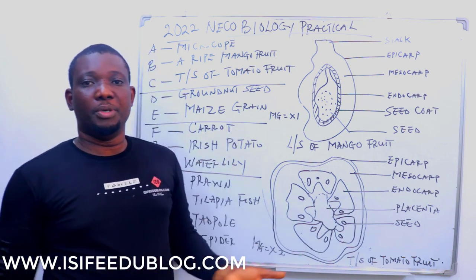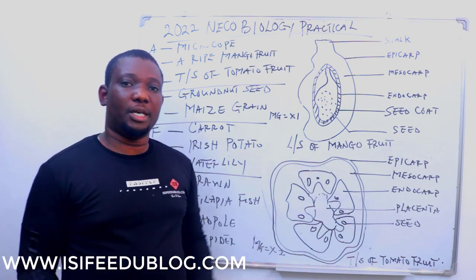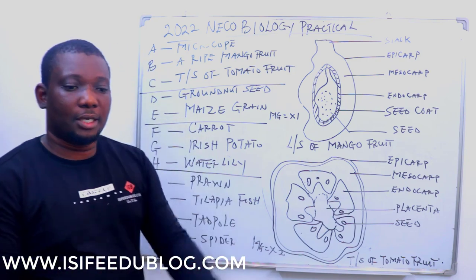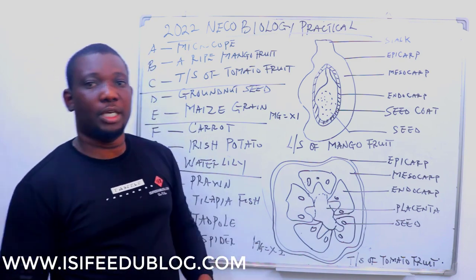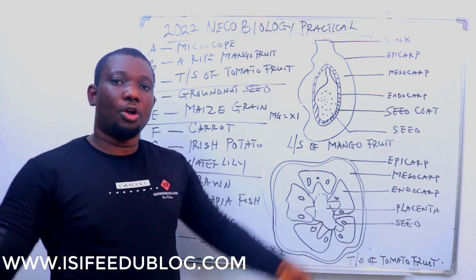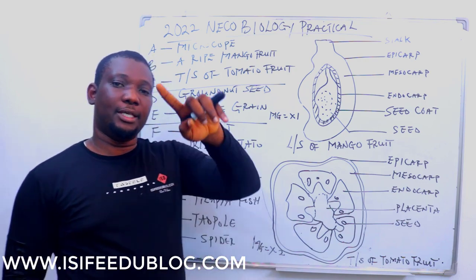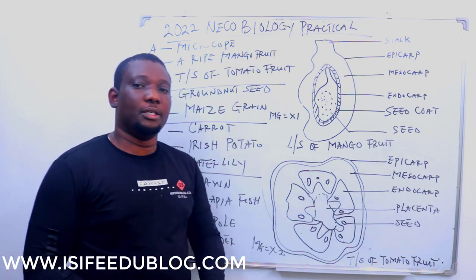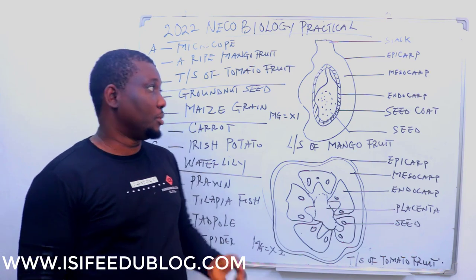The role of the base is to carry the whole of the microscope, and it is the part that is most likely kept on the table. It sits the microscope on the table through its base. So the base holds other parts of the microscope. Then the handle ensures that the head is connected to the base and it is carefully handled.